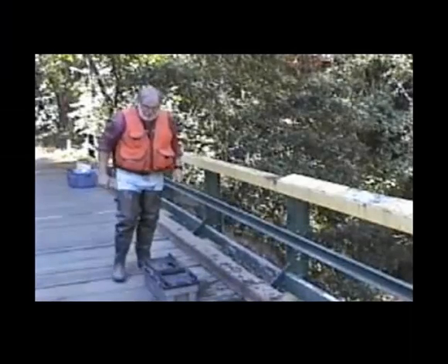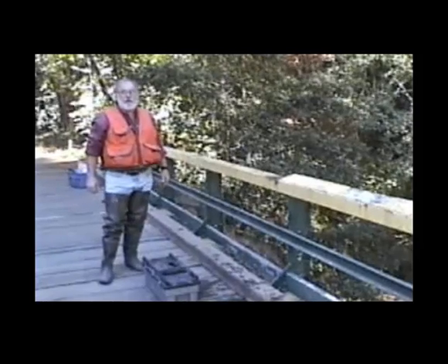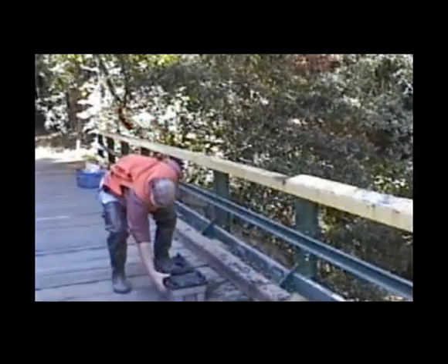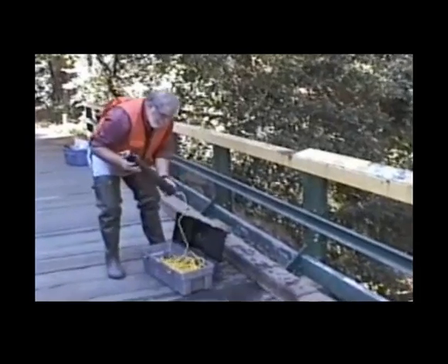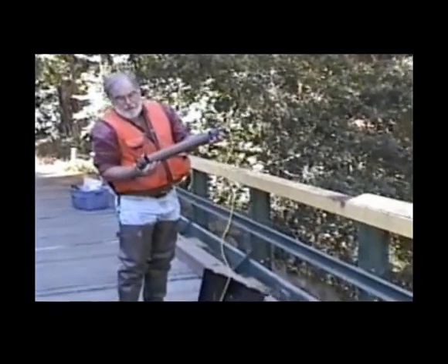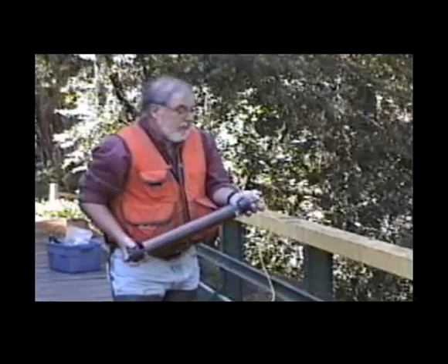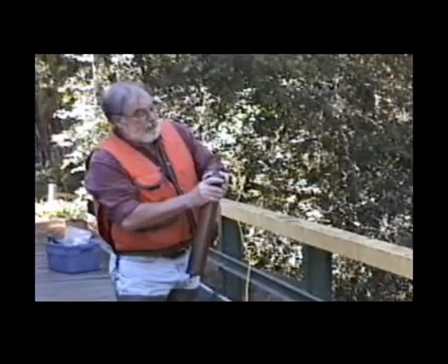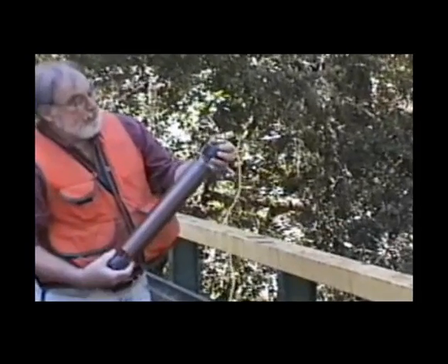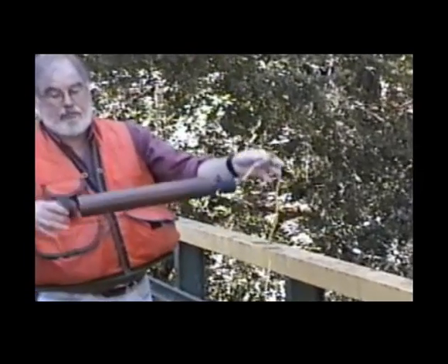Okay, I'm going to demonstrate the use of a discrete sampling device known as a Kemmerer water sampler. The device is basically a hollow copper tube with 2 end seals made out of black rubber, and it is held open by a spring mechanism that slides on a rod that goes through the sampler, thus holding the 2 ends open to the water.